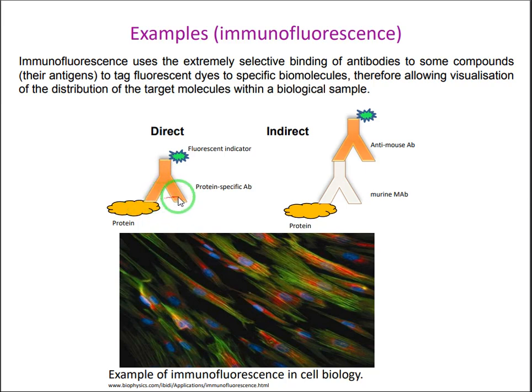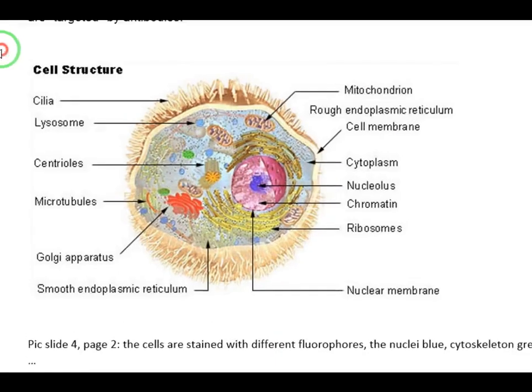So if we accommodate these antibodies with fluorescence molecules, we can treat our proteins with these monoclonal antibodies, and then appreciate the different colors under the microscope. We can introduce antibodies which are specific towards different parts of the cells. Let's have a better look at it.